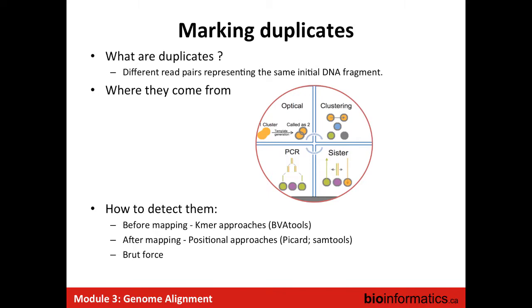When you merge, if everything merged together, yeah, you can just use that one and say, okay, I could increase my mapping quality. But your mapping quality, if you have exactly the same thing, should be the same for everything. So I don't see how you can really improve your mapping. Your mapping quality is that way.